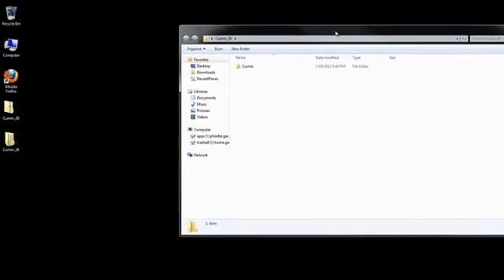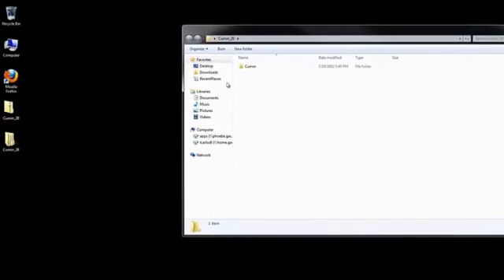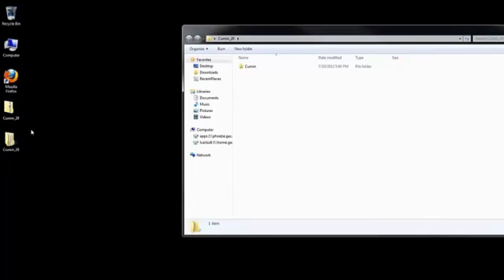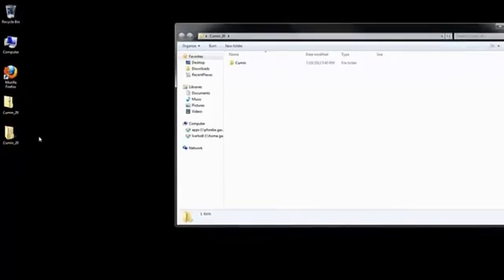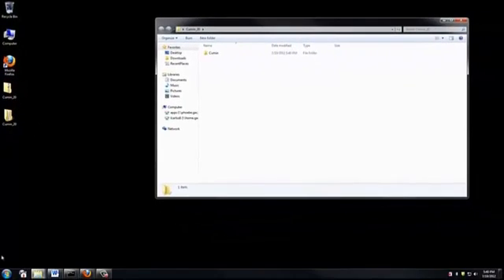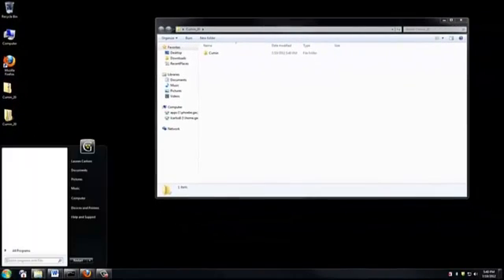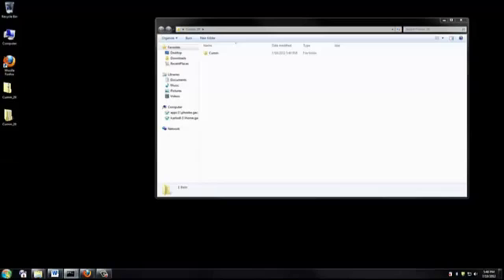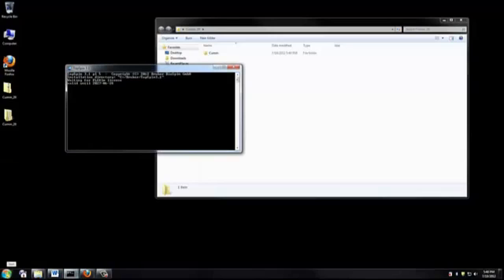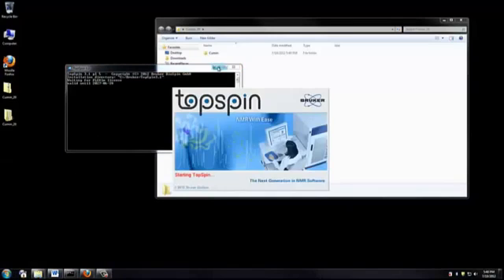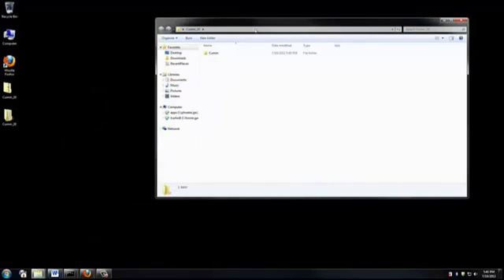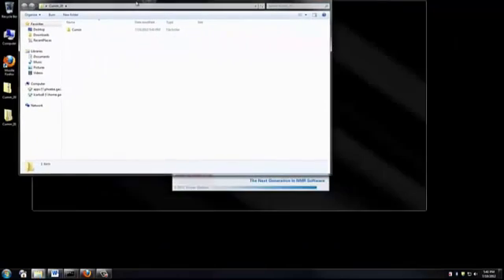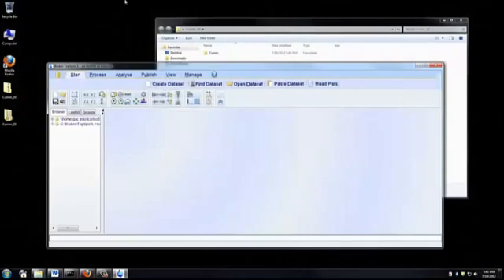Now I have usable data. You can also see that another file appeared below the zip on my desktop. The next thing we need to do is open Topspin. So I'm going to search for it in the search bar and open the application.